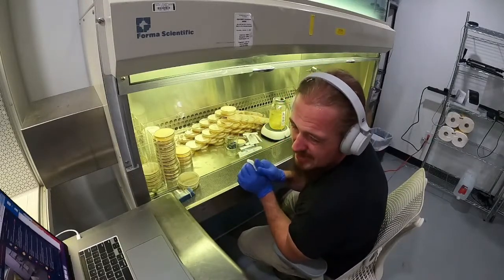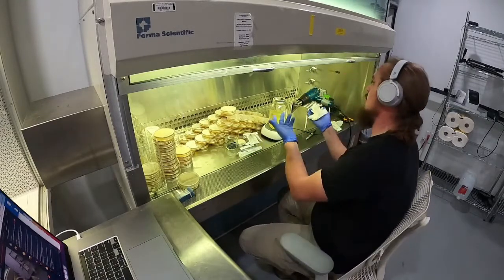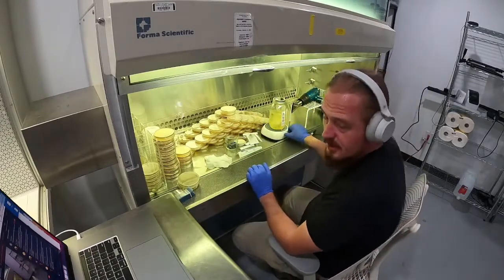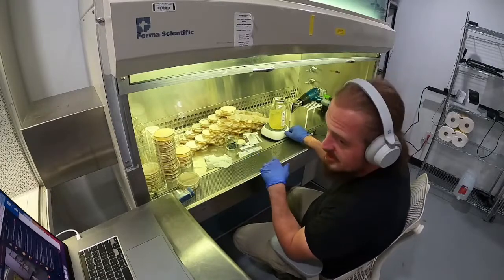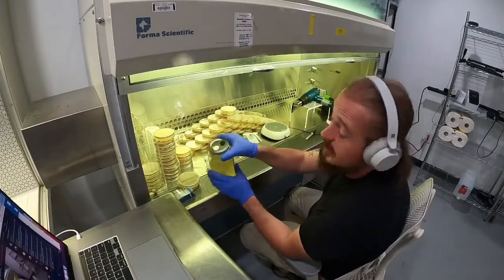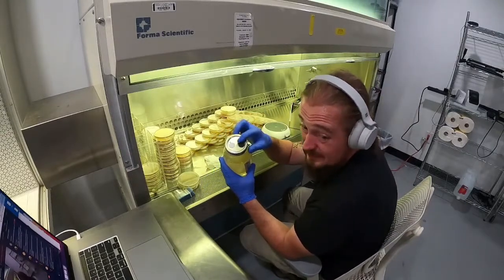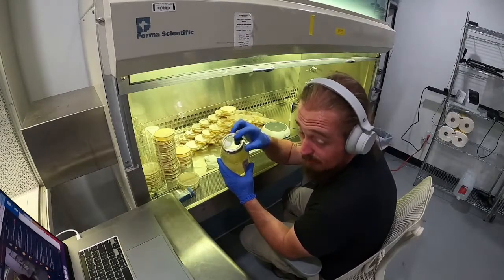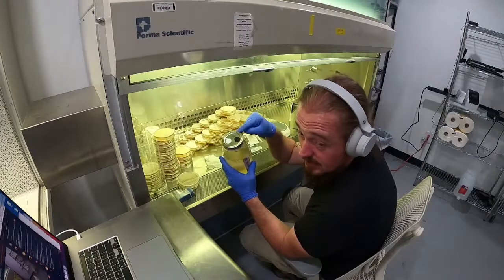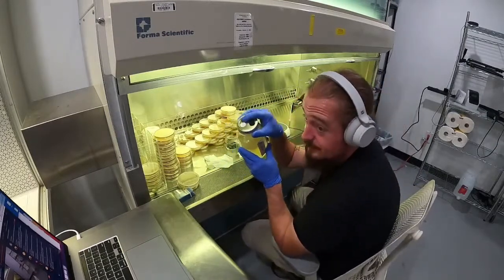Syringe filters, I don't really use them. I found them to be fussy and kind of a pain in the ass. We use Microfose filters. You can catch them on Instagram, and we also sell them on the website. But these little filter patches we use everywhere. We use them on our grain bags. These are adhesive, right? So we sterilize with these on the jars. For example, our grain bags are sterilized, then we adhere these filter patches, also adhesive.